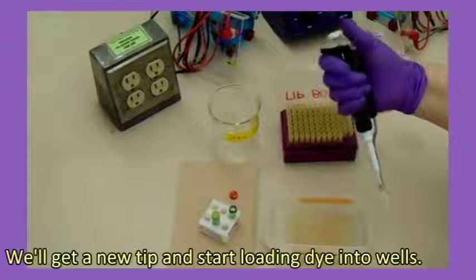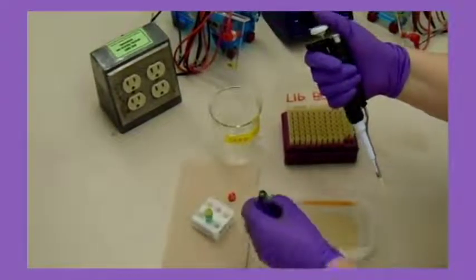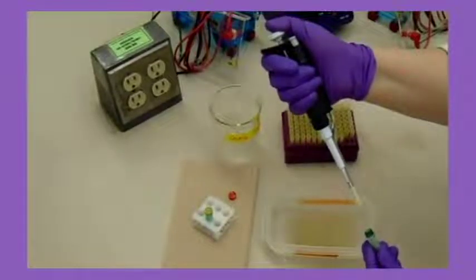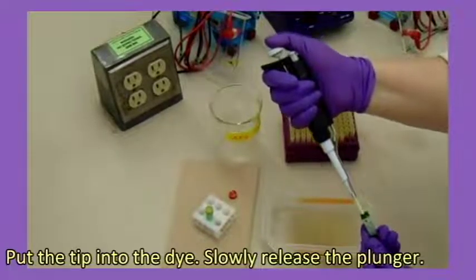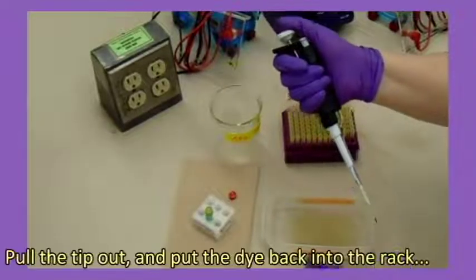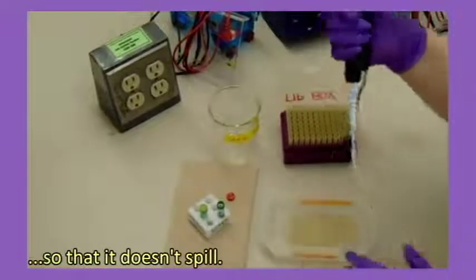We'll get a new tip and start loading dye into wells. Press the plunger down to the first stop and hold. Put the tip into the dye. Slowly release the plunger. Pull the tip out and put the dye back into the rack so that it doesn't spill.